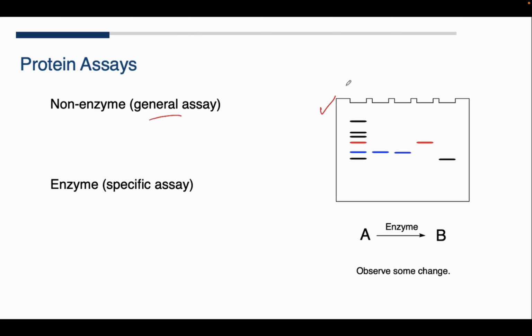That can be something like SDS-PAGE. We detect any protein, and so we can follow along: are we getting the protein, by its weight, and we can follow each fractionation step. In graduate school, my protein didn't have enzyme activity, so we isolated it just by running a gel and looking for it.